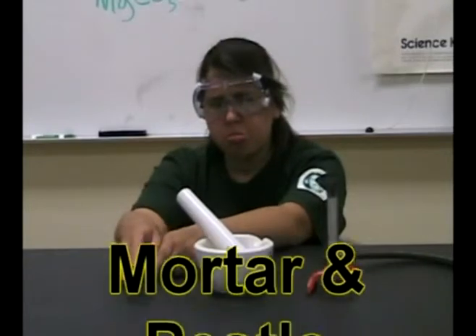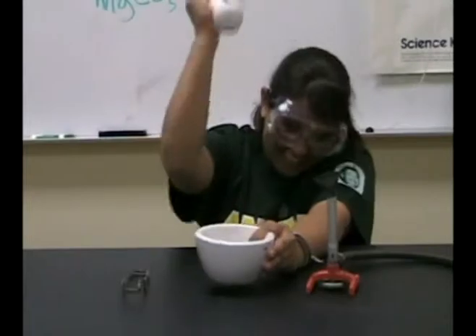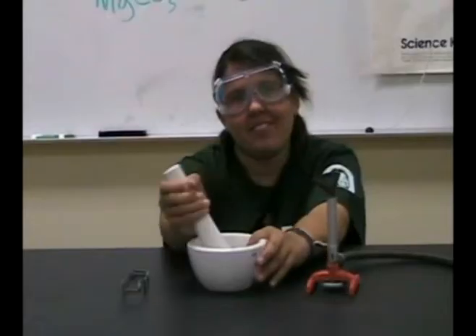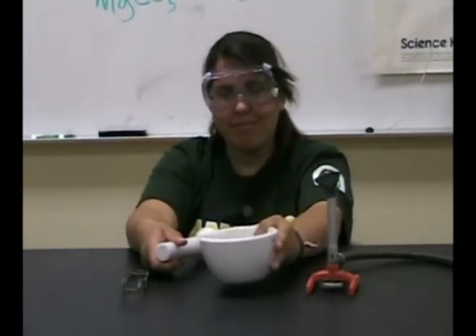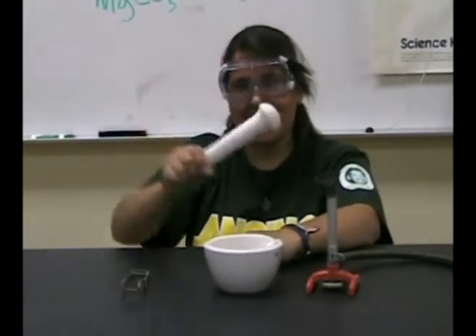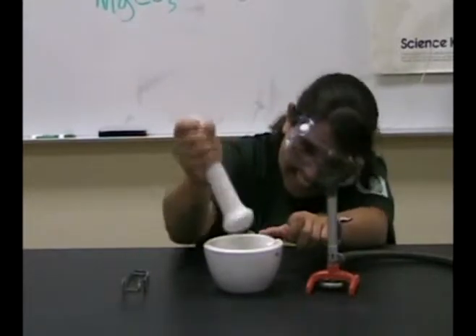Mortar and pestle. Mortar and pestle are used for crushing solids. They can come in a variety of sizes. The bowl-shaped part is the mortar. This is where you put the solid you wish to crush. Then you use the pestle or stick-looking thing to crush the solid against the sides.